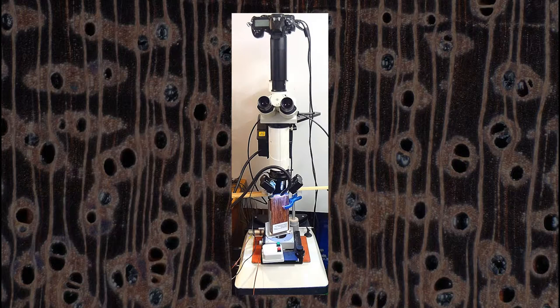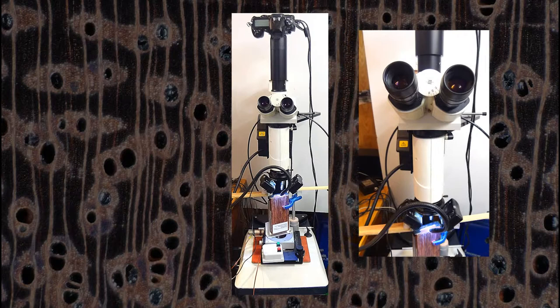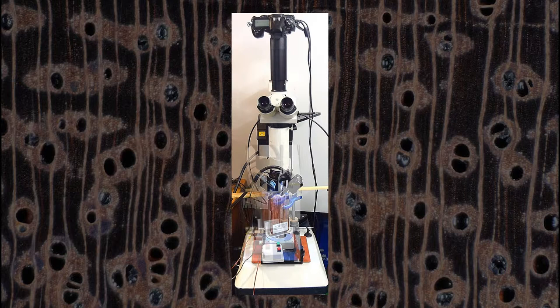The second is the body that is motorized for displacements. The third is the optical shooting.